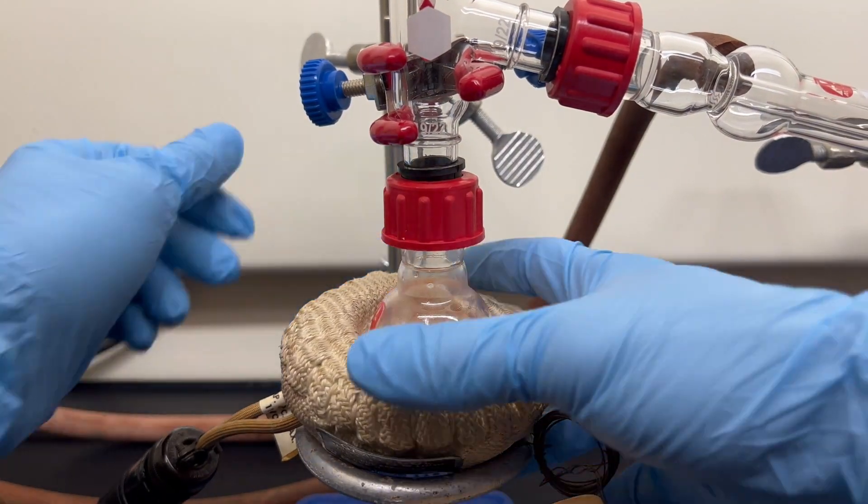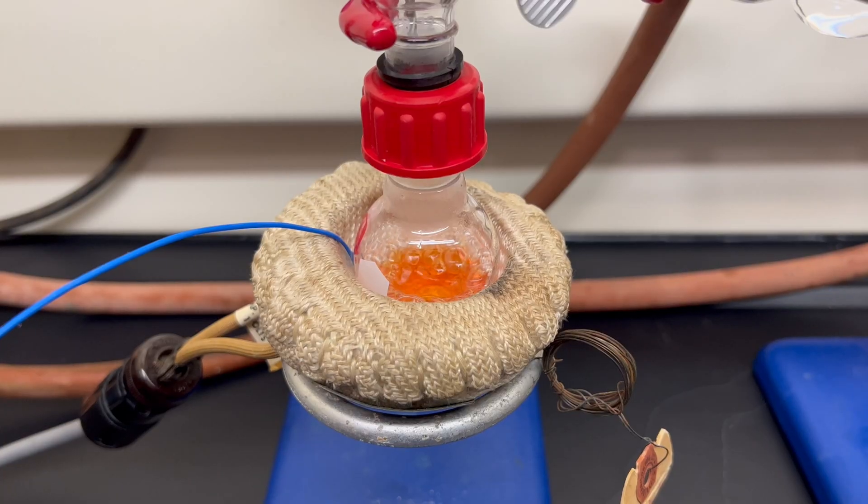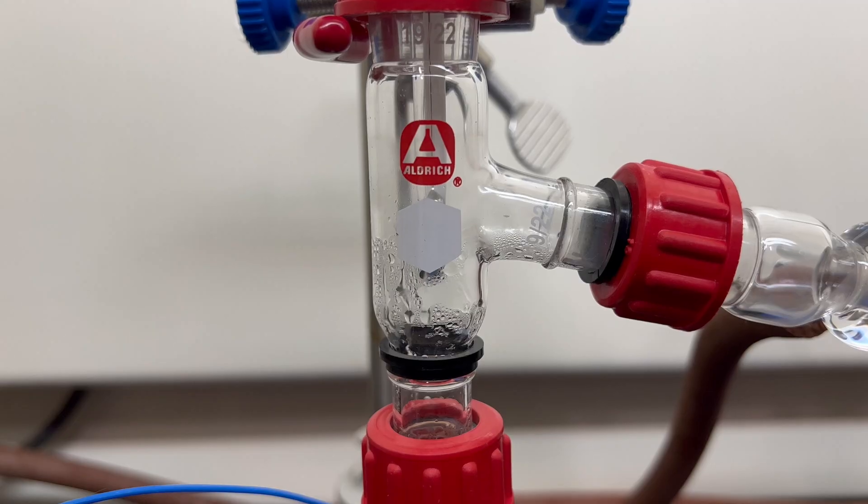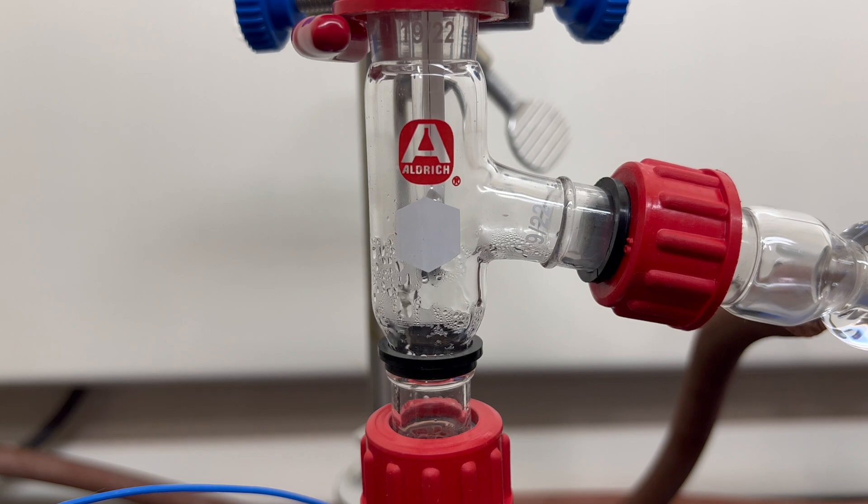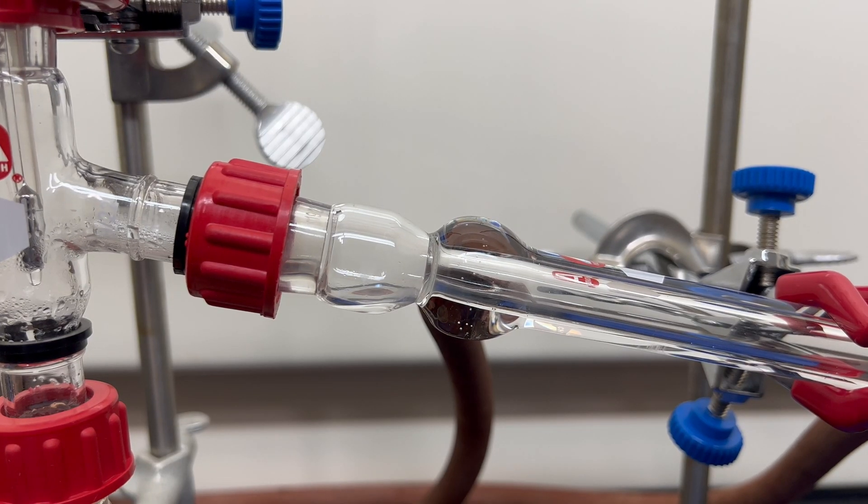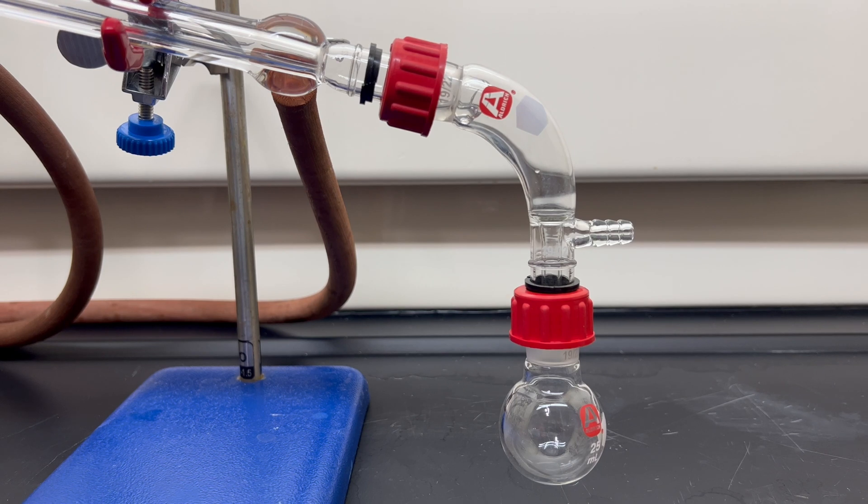Loading a flask with the crude, we can start a distillation. Only product that comes over at 80 degrees Celsius is kept. Anything outside that temperature will be impurities from the crude. High temperature reactions such as decarboxylation are known for producing many byproducts, hence why the cleanup steps are needed.